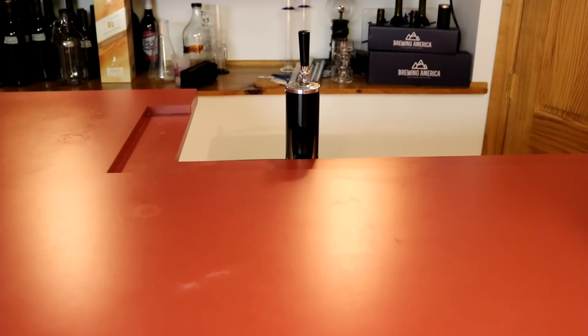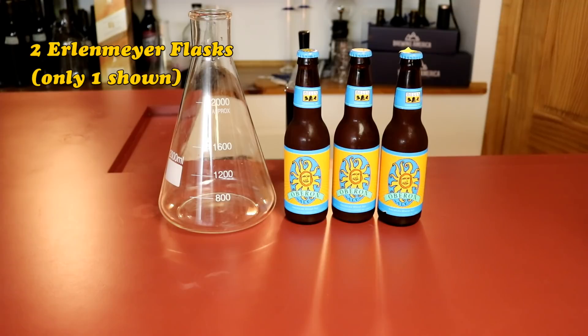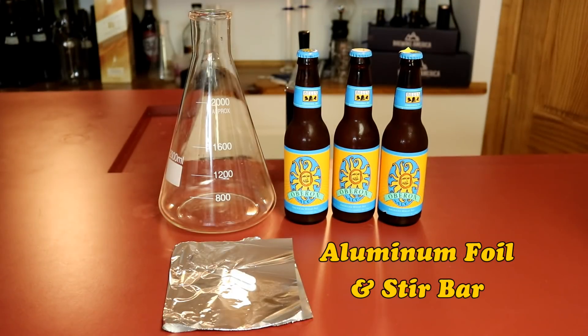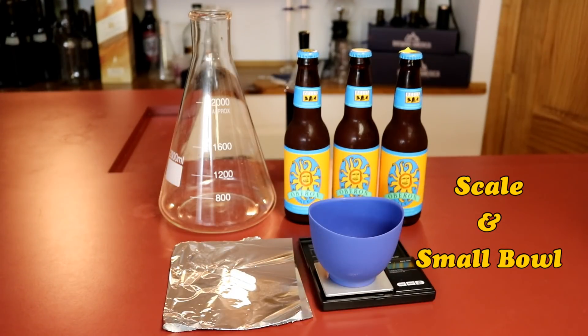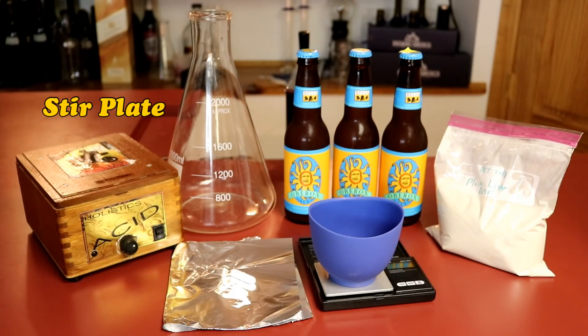First of all, there are a number of things that you need to do this, including one to three bottles of Bell's Oberon, a couple of Erlenmeyer flasks (only one is shown here though), some foil and a stir bar, a scale and a bowl, dry malt extract, and a stir plate. Let's get moving.